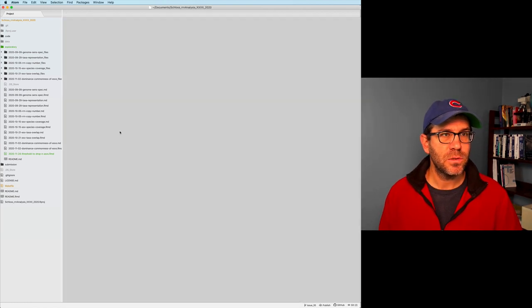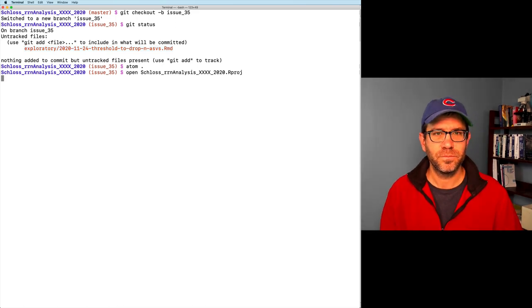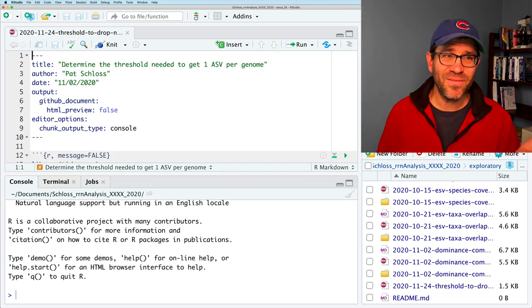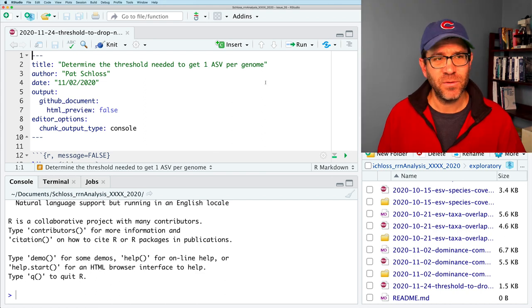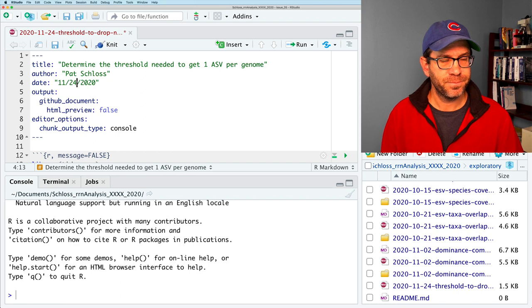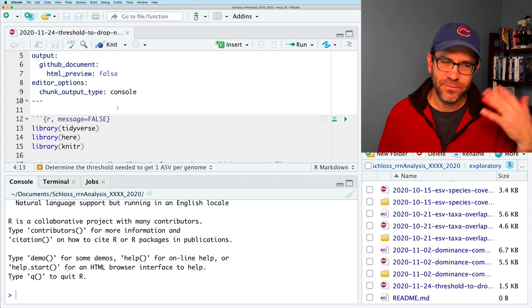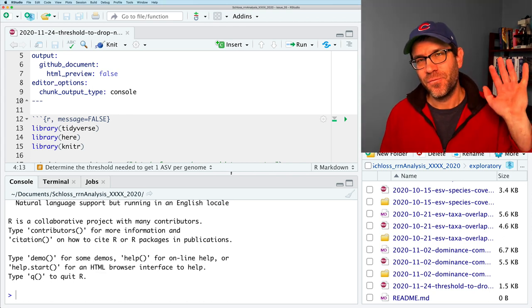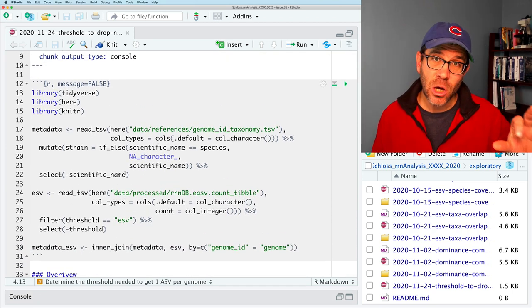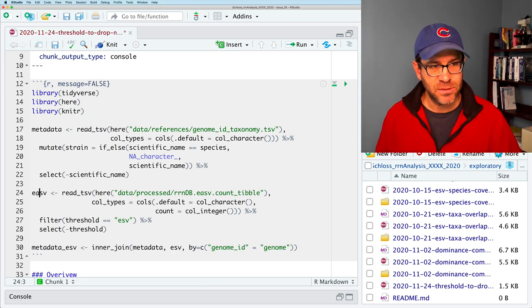I'll fire up RStudio. The title I've given the document is 'Determine the threshold needed to get one ASV per genome.' I'll update my date — it's Thanksgiving week, the 24th. I want my chunk output to go to the console as I'm developing this, because if you've watched the other episodes, you know I really struggle with this. I've roughed in code from previous episodes to read in the metadata as well as the EASV data.